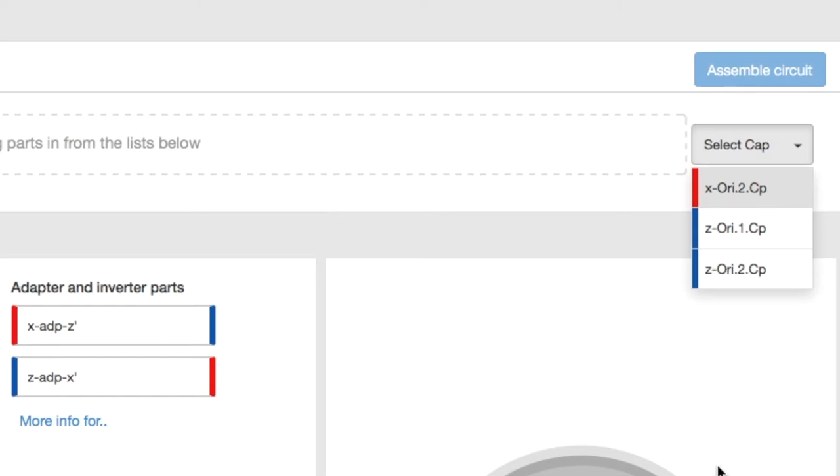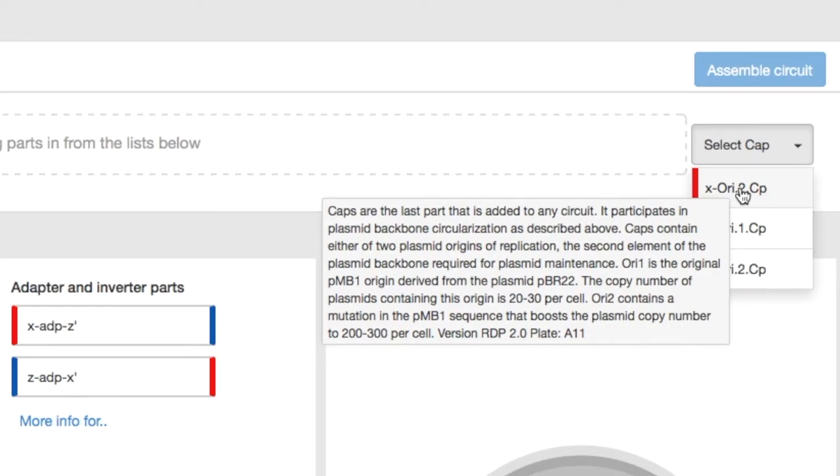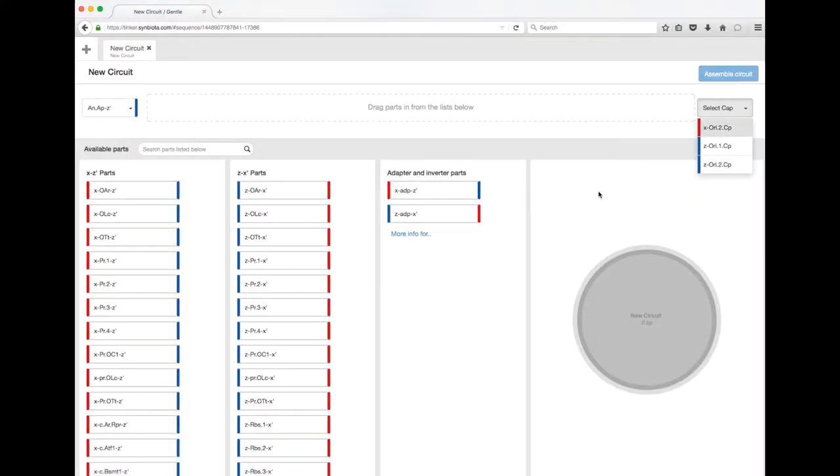If your DNA isn't being copied, eventually your DNA will dilute out and you'll have cells that don't have your plasmid in them. Only one plasmid will go into each cell, so if you don't have an origin of replication you probably won't even see any bacteria grow. There are two different origins: dot-one tells the cell to keep roughly 20 to 30 copies of your DNA programs per cell, whereas dot-two tells the cell to keep an order of magnitude more — about 200 to 300 per cell.